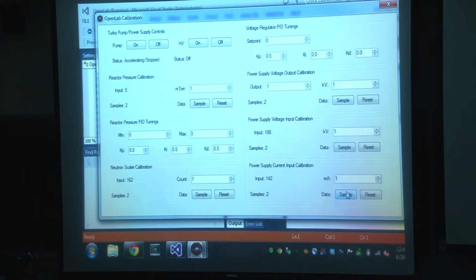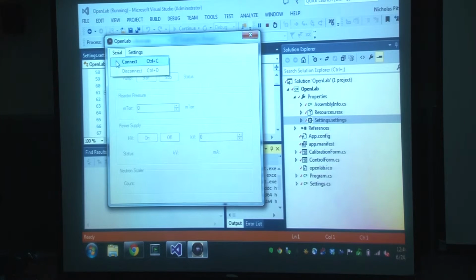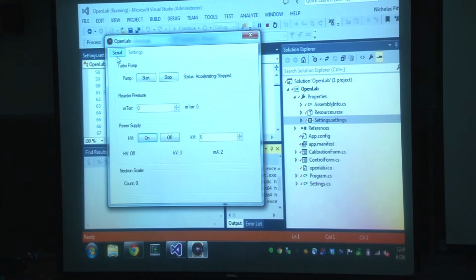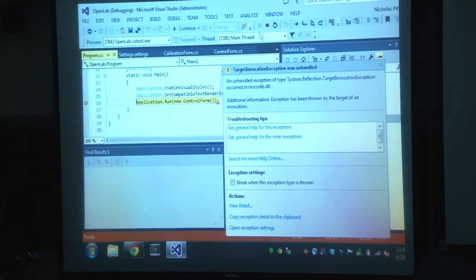This is sample. And then you collect data and control your equipment. If you disconnect it, this was actually a giant pain in the butt, it wouldn't disconnect properly. It actually works now. It took me a while to get. Oh, maybe not, it's frozen. Crashed.